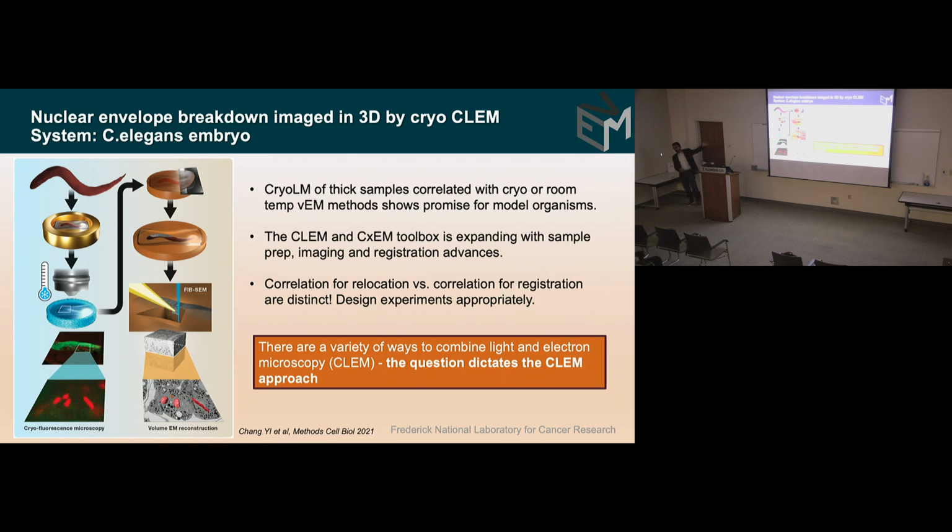And you don't need light microscopy, or sometimes in tissue level imaging, you cannot get light microscopy imaging, because how are you going to do it, right? You take something from, say, the mouse, and it's very difficult to get fluorescence imaging unless you permeabilize it and do expansion microscopy. And anytime you do that, you're destroying the ultrastructure and you can't get EM.